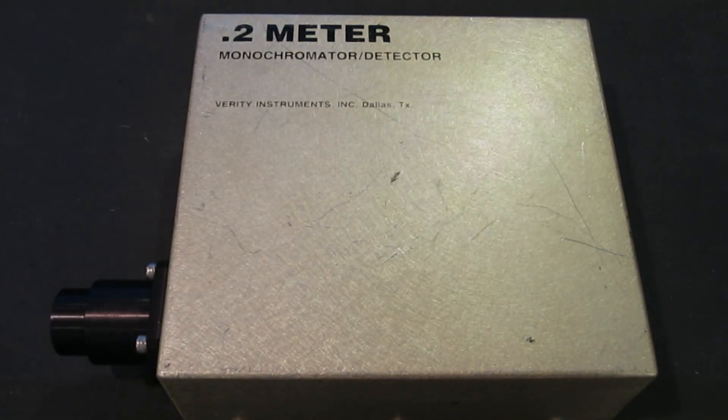What you're looking at here is a 0.2 meter monochromator detector made by Verity Instruments. The model number is EP200MMD, so it's a manual adjustment type. You've probably already seen a very similar monochromator teardown on the Signal Path where Shaheer did a very nice video explaining how it works and he also did some modifications to make it a scanning monochromator.